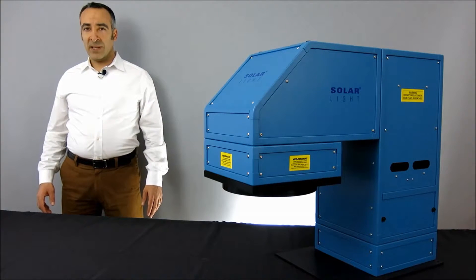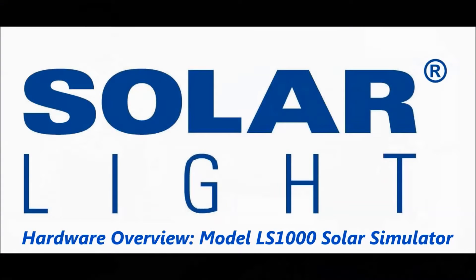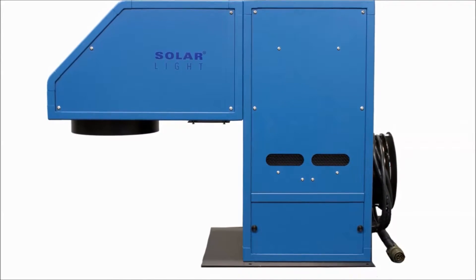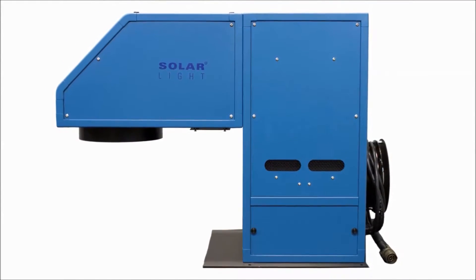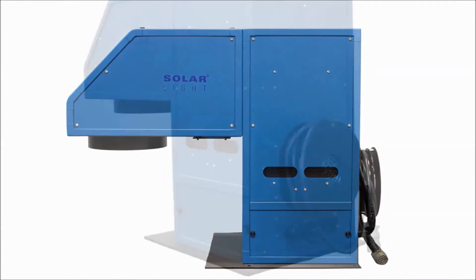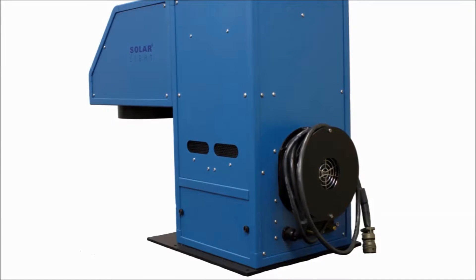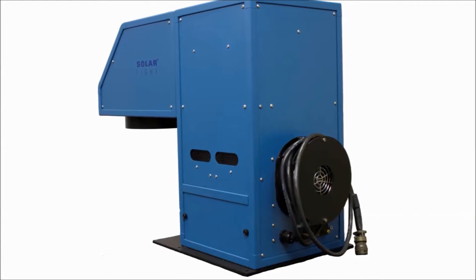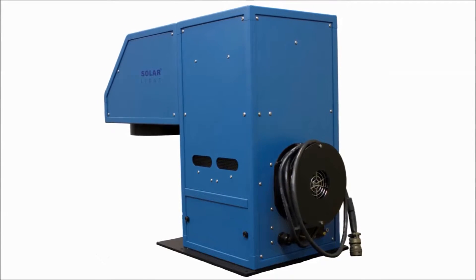Let's take a closer look at these simulators in greater detail. The LS1000 series simulators are high-precision, full-spectrum turnkey material testing light sources for professional and laboratory applications. These units' collimated class ABA output produces solar UV radiation in the range of 290 to 400 nanometers, or full-spectrum sunlight.